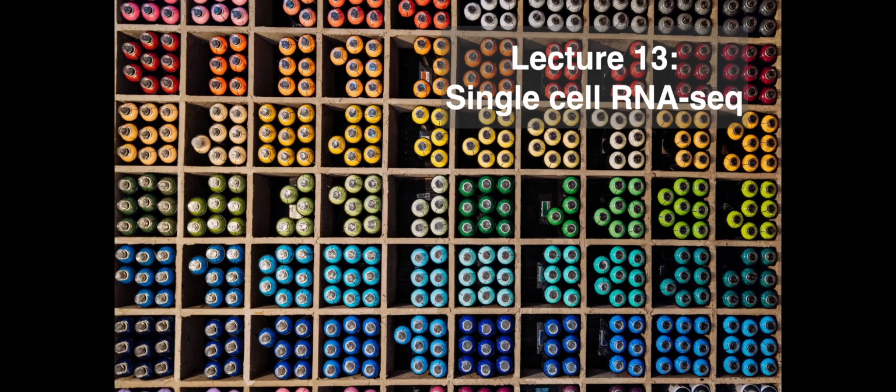Now, as we make this transition from bulk to single-cell, I want you to keep in mind that a lot of the tools and concepts that you have already become familiar with will absolutely feature prominently in these lectures and in dealing with single-cell RNA-seq data. We're still going to have to carry out read mapping. There'll be some filtering. We definitely have to think about normalization. Dimensional reduction will feature very prominently, and we'll need to identify differentially expressed genes. So at a high level, we still need to go through these steps. But because single-cell RNA-seq data, and in fact any new data type, has its own nuances or features that make it unique, we have to think a little bit about exactly how we do these steps.